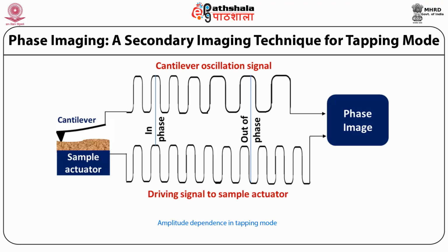As the cantilever oscillates, it will exhibit a phase shift phi between the drive and the response, which is denoted by the equation d = a sin(2πft + phi), where d is the deflection, a is the amplitude, f is the frequency, t is the time, and phi is the phase shift.